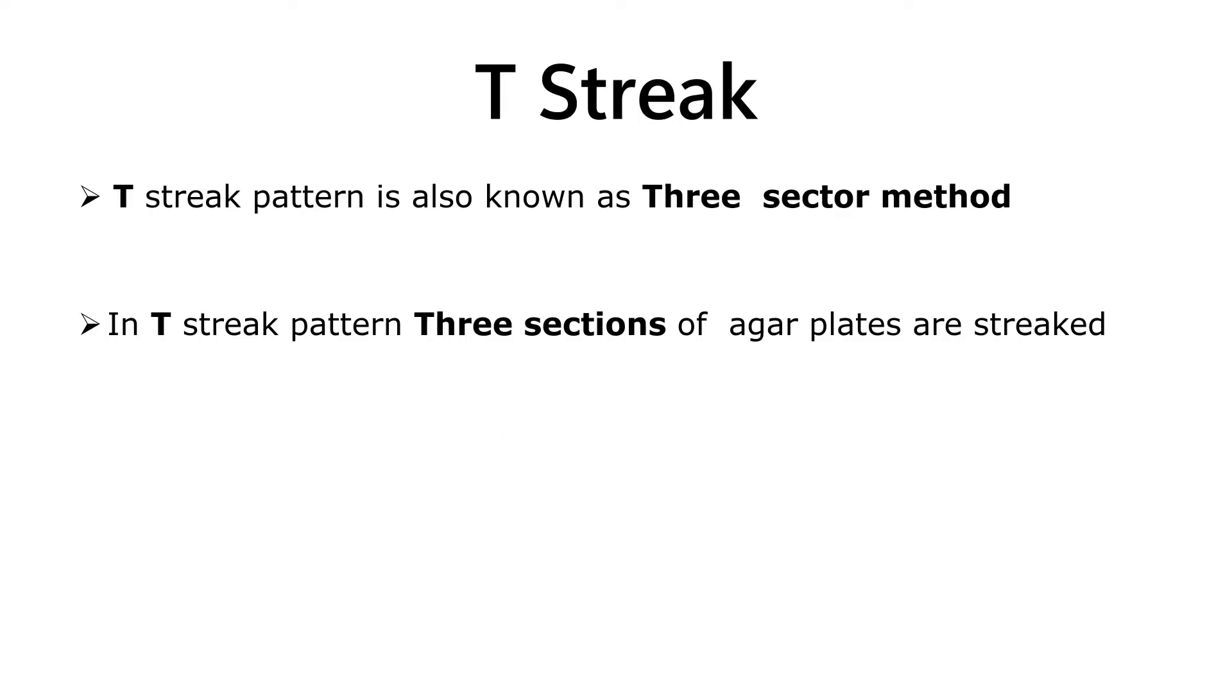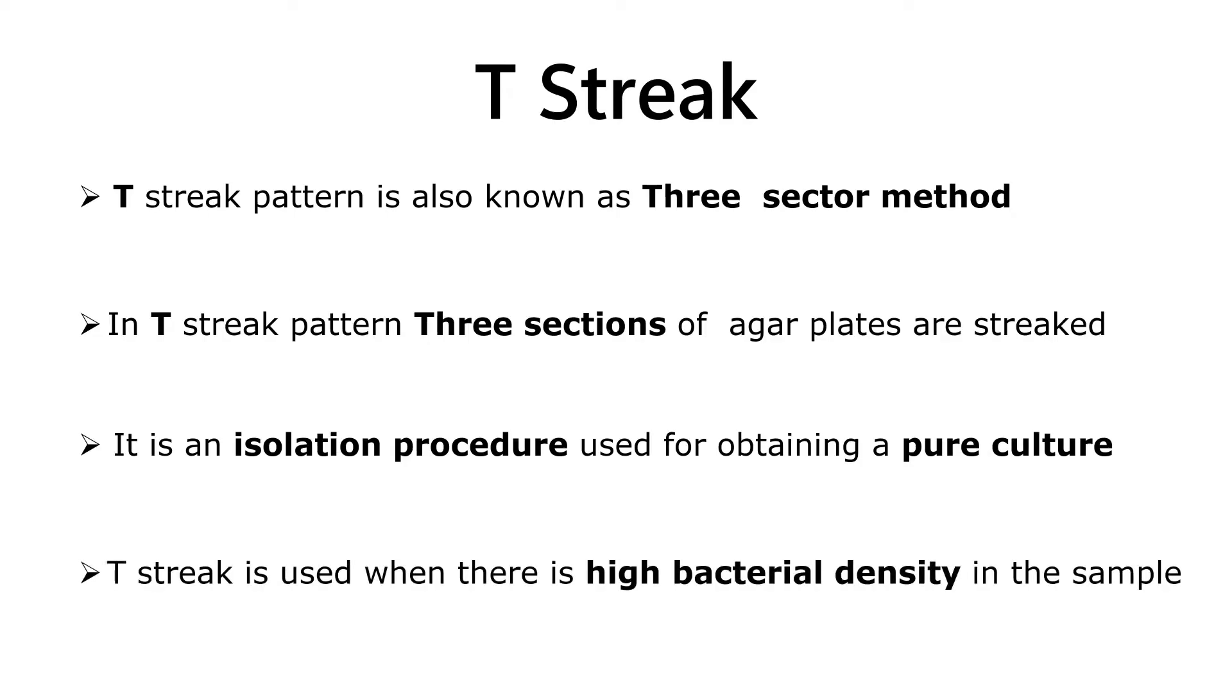It is an isolation procedure used for obtaining the pure culture of organisms. T-streak is performed when there is high bacterial density in the sample.